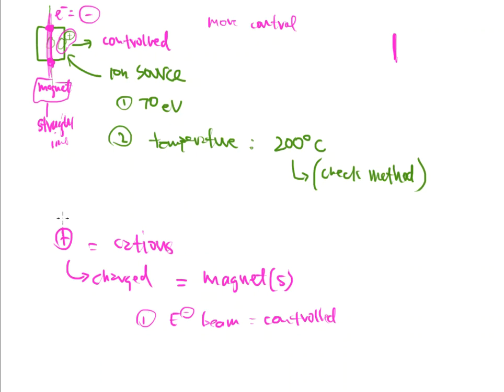As long as that is doing its job the right way, the molecules are going to get slammed with the electron beam, and that's what we want. Number two, we're creating a positive charge here.